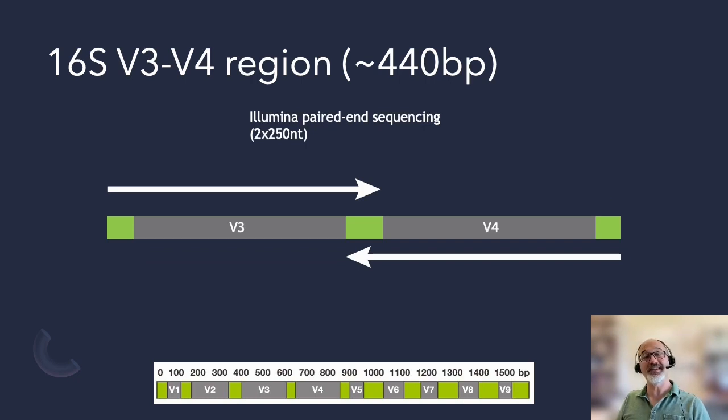So you may want to add V3, but the ends of the sequencing reads will barely overlap. So V3, V4 is about 440 bases, and you get a small overlap of around 10 to 20 bases depending. There's a little bit of variation in this region as well. So sequencing errors at the ends of the reads can cause issues with merging, and so you want to have a workflow that can adapt to that and potentially rescue reads, as well as a workflow that can maybe use only one of the reads for the analysis, as a single end analysis.